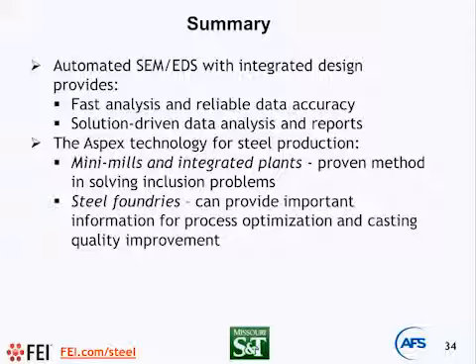First of all, automated analysis allows us to collect absolutely right data about the spherical graphite population. When we use optical analysis, we cannot differentiate small graphite inclusions versus non-metallic inclusions. So when we use the standard procedure for evaluation of nodule count or nodule size using an optical system, we typically ignore small particles.